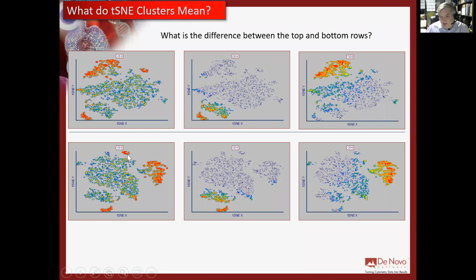Because these are different, though, it doesn't mean that the clustering information isn't the same, right? I ran the same data file, but it's showing here that the CD3 positivity, this little cluster that's up here, it's probably the same one as here, not just because it's the same shape, it's kind of the same size. We have a bigger kind of cluster over here. It's probably the same one there if I went in and set some gates. So they've moved all over in this plot, but it's really the same clusters. It's the same phenotypes, just existing in different positions on the plot.